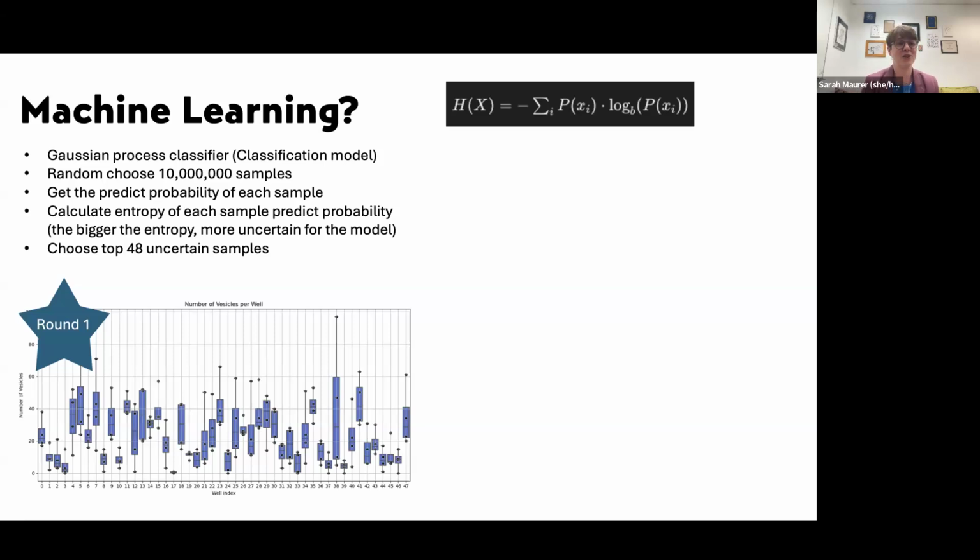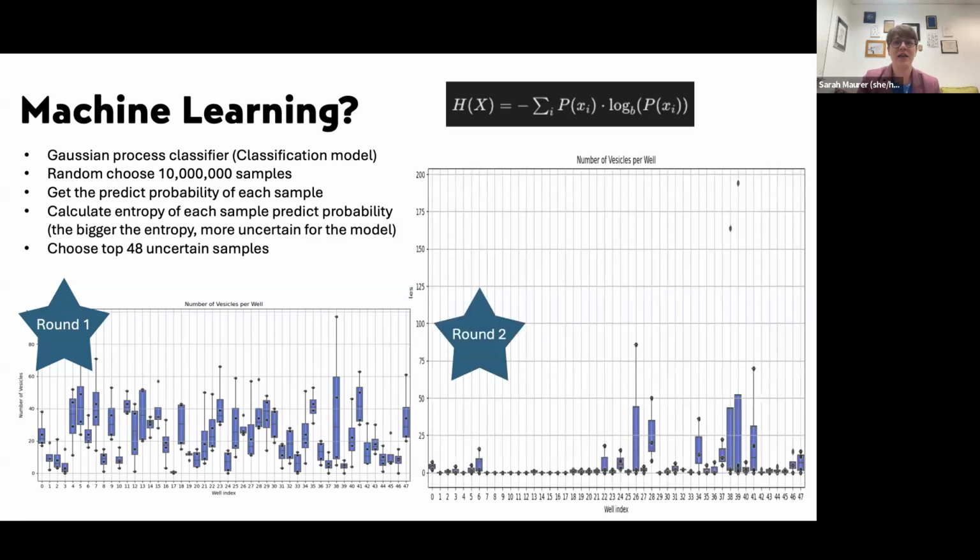And so we decided to reduce our total concentrations. And so in round two, we had far fewer samples with vesicles. So we had lots of negatives, but also we had some samples that had many, many vesicles found. And now that we've been doing this for a little while, we have had some samples that have had close to 1,000 vesicles in 4 micrographs. So very, very high concentrations of vesicles found, or liposomes found.